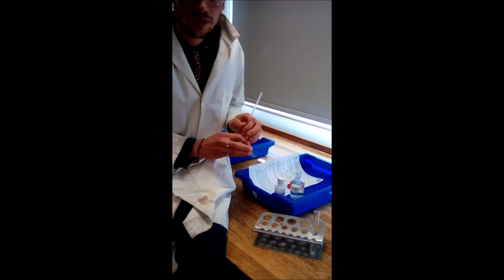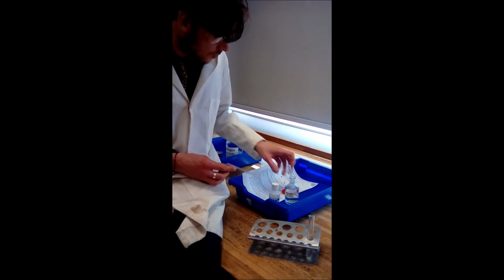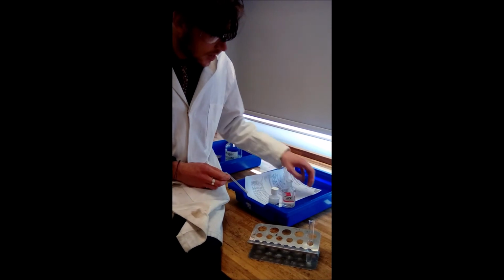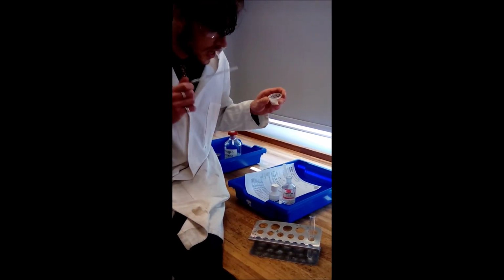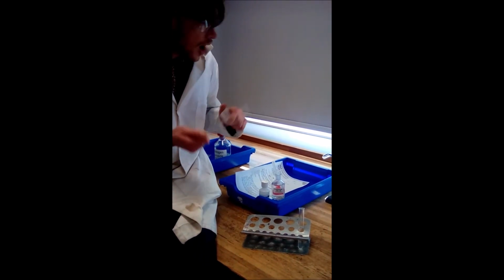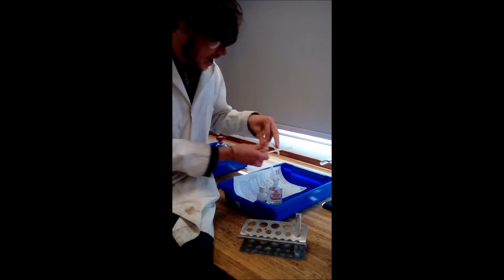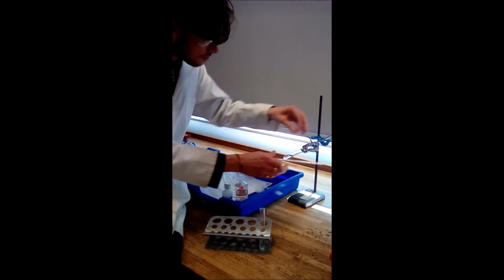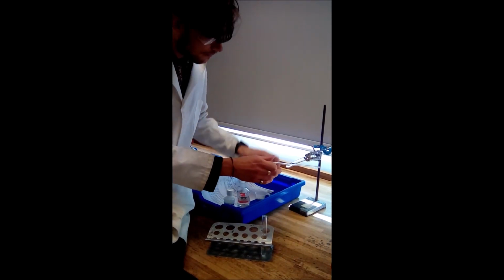Third test now, which is carbon dioxide. What I've got here is some hydrochloric acid, and then some marble chips, so calcium carbonate, and we're going to test to see whether it creates carbon dioxide. So I put my hydrochloric acid in here, and I'm going to add some marble chips. Now these marble chips react with the hydrochloric acid, releasing carbon dioxide.